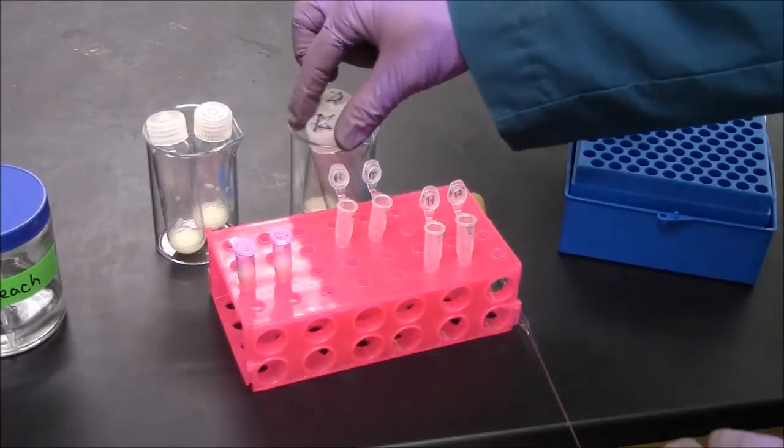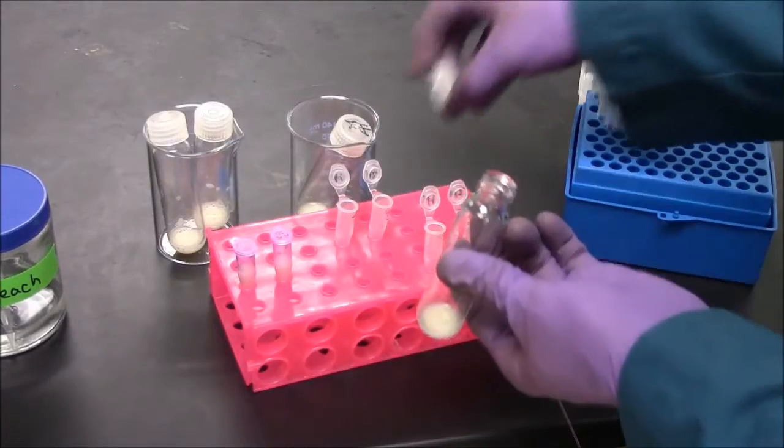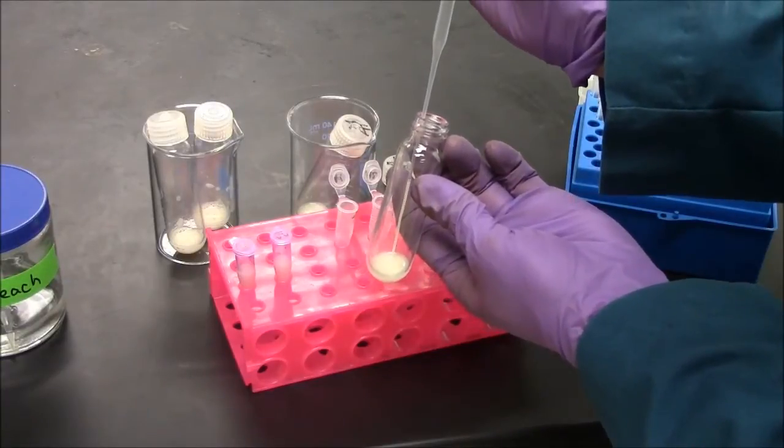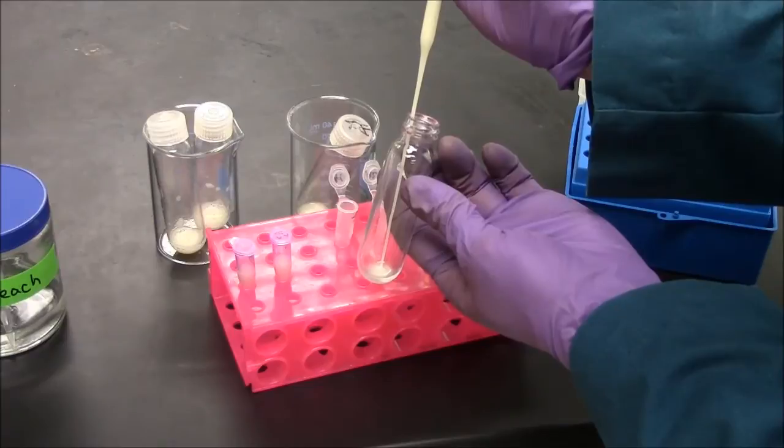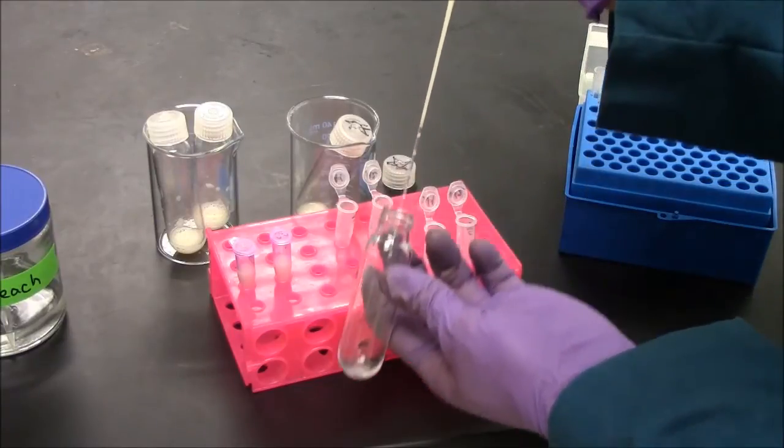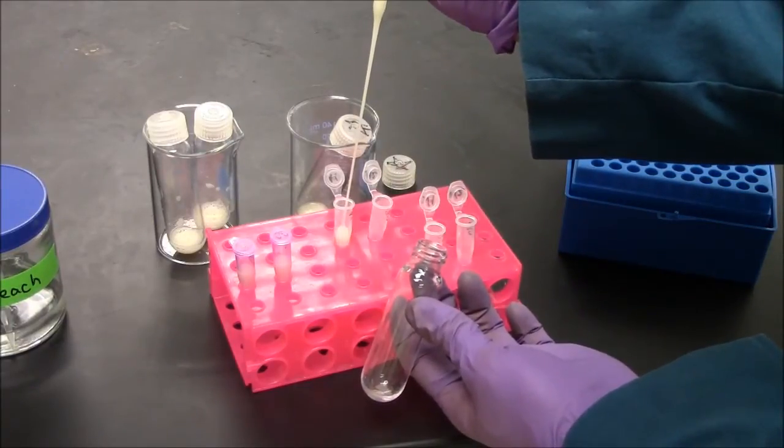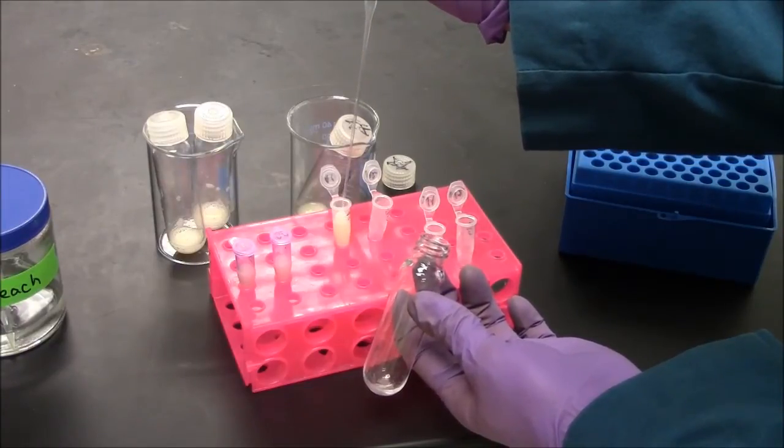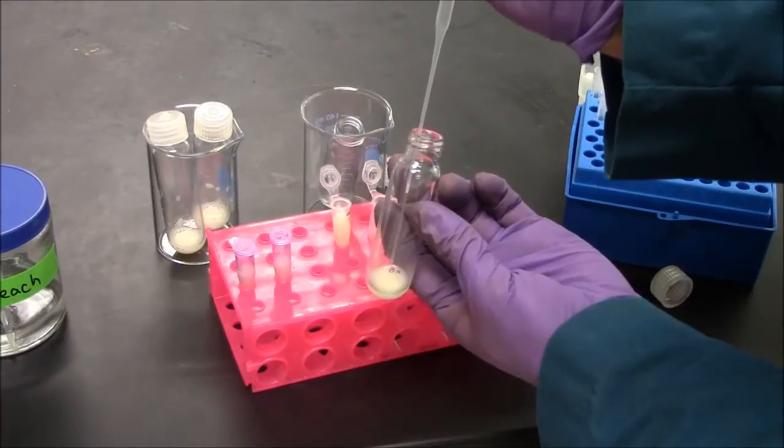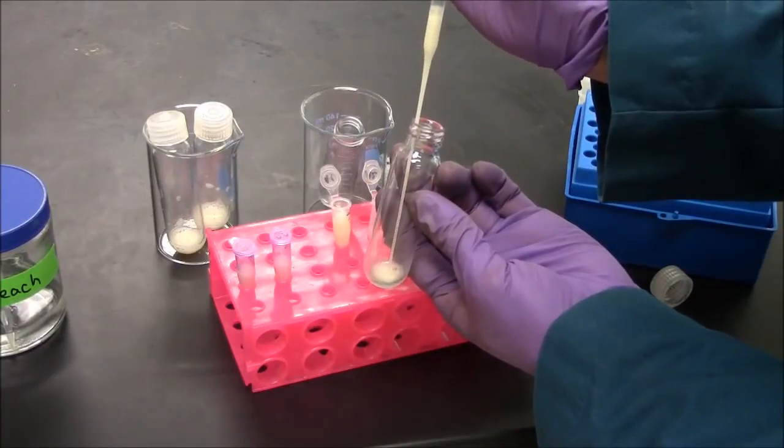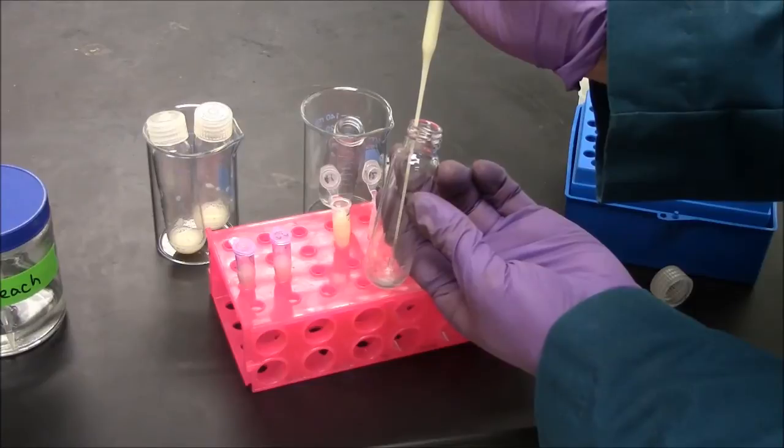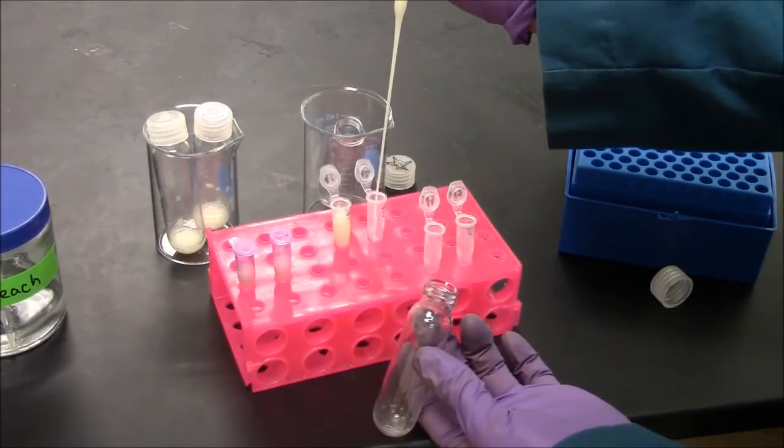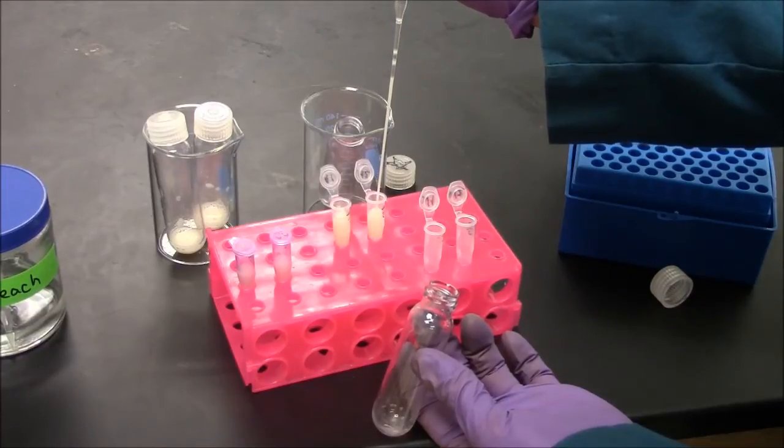I've pre-weighed these Eppendorf tubes and I'm transferring the cells to the tubes with a Pasteur pipette. Best to get everything in one pipette. These Eppendorf tubes have a maximum capacity of 1.5 milliliters. So we're putting in maybe 1.1 or 1.2 if you include the volume of the cells.